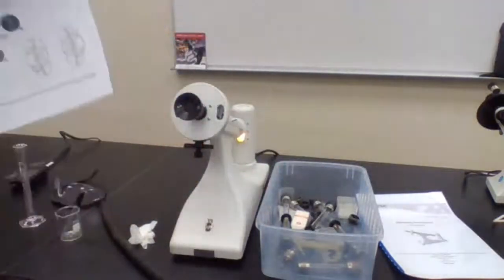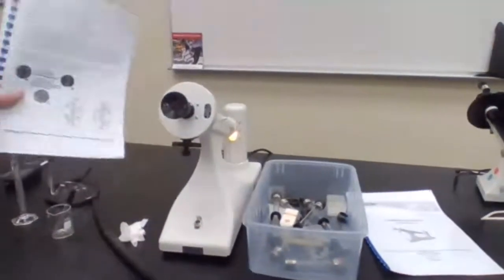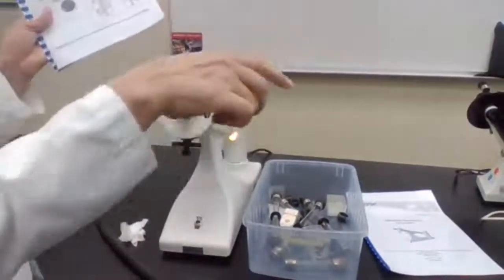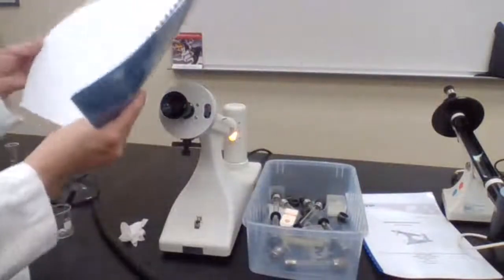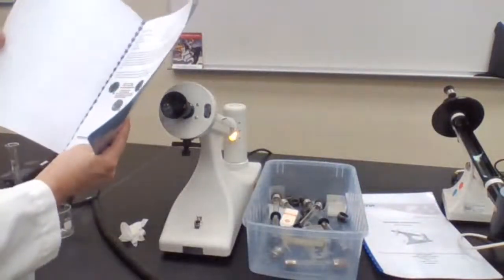Going to repeat it a couple times. It's a new machine, so it's slightly different from the machine that I used before, but it's very nice actually. It's much more clear.